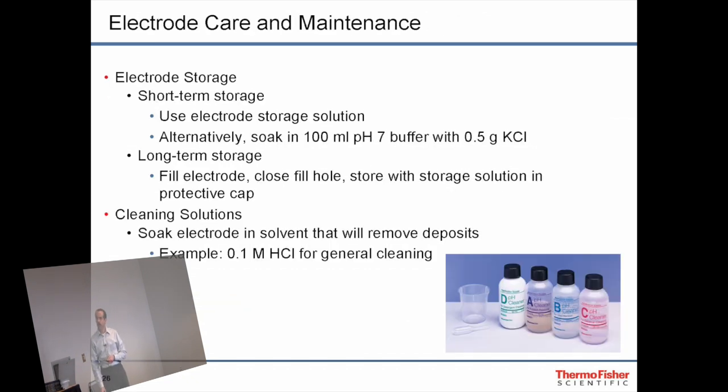So care and maintenance for your electrode, how do you store an electrode? Whatever you do, don't store your electrode in water. Water's the worst thing you can do to store your electrode. Tap water, deionized water, distilled water. Because what's inside an electrode is very high in salt, the water just sucks the ions out of the electrode and really shortens the life.